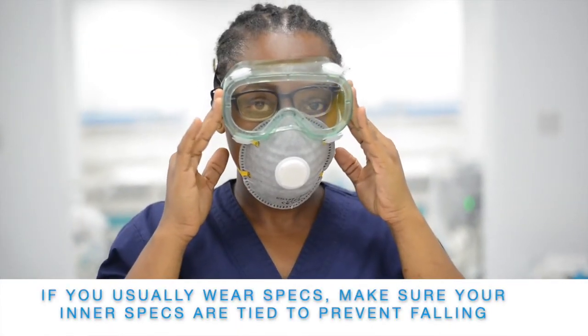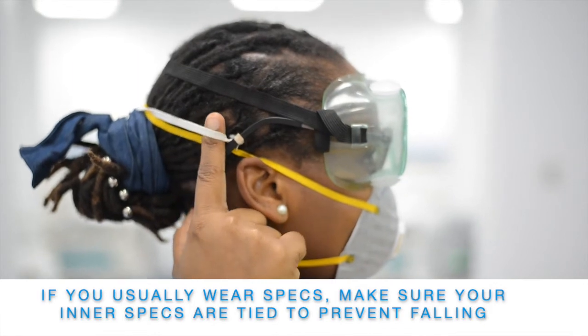If you usually wear spectacles, make sure your inner spectacles are tied to prevent falling.